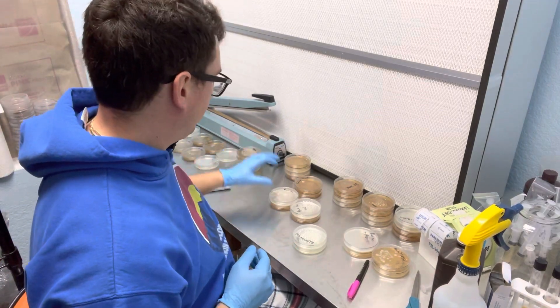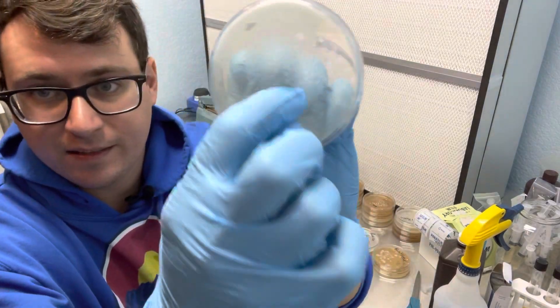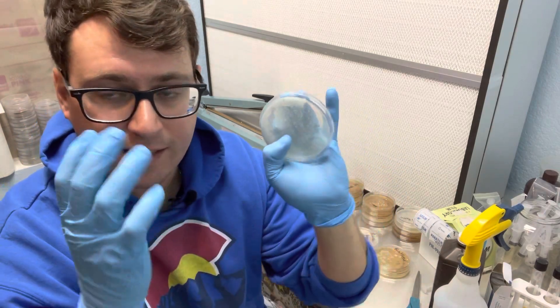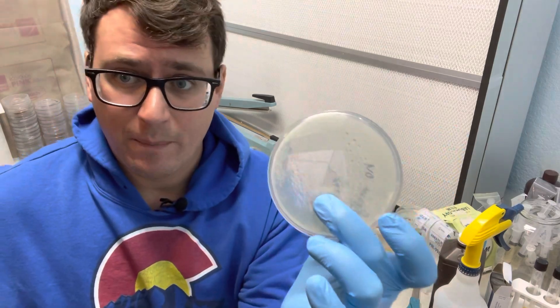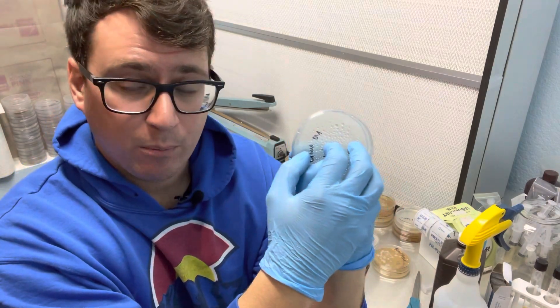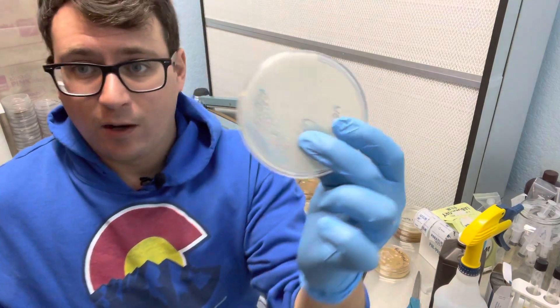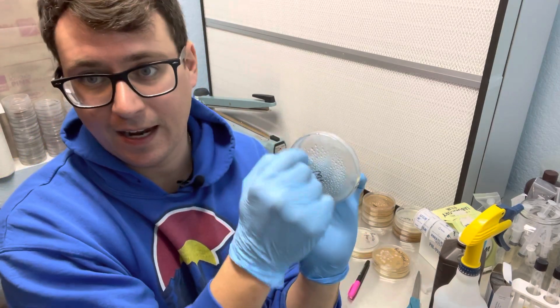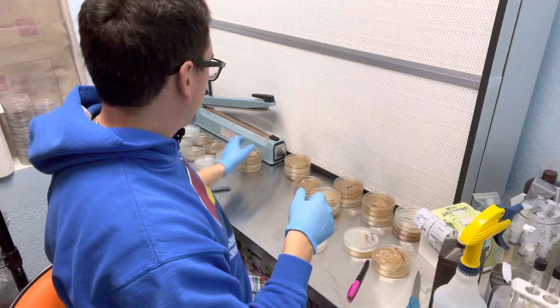So if you think about this petri dish here with the brown oyster — all of those colonies that are kind of really clumped together could potentially be a different color, a different volume of production, different flavors, different substrates. That is what makes up a phenotype — the physical capability of that mushroom. Even though they came from the same predecessors, all of those colonies can yield different results. They're going to overlap and compete over the next few days, and then I'll get a nice white colony that I can take sections from the edge — so that will be my phenotype selection.